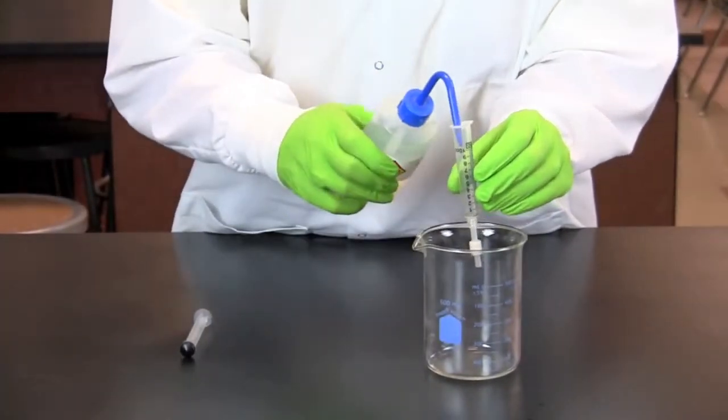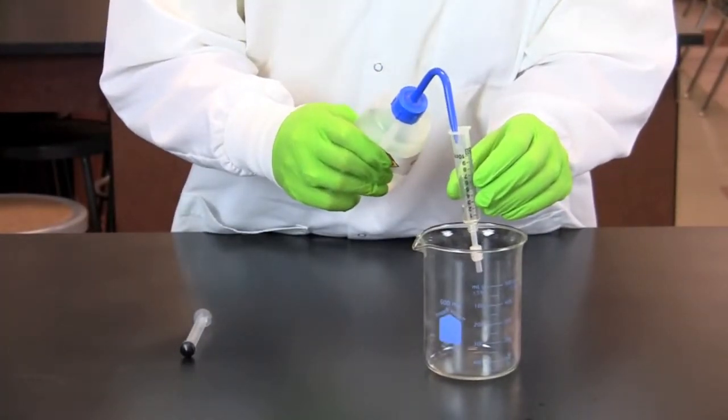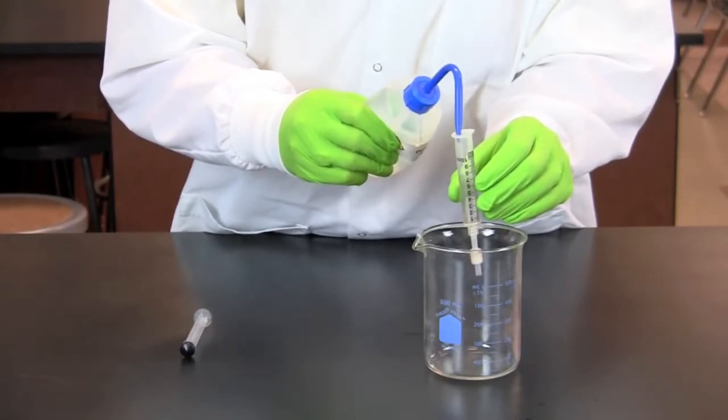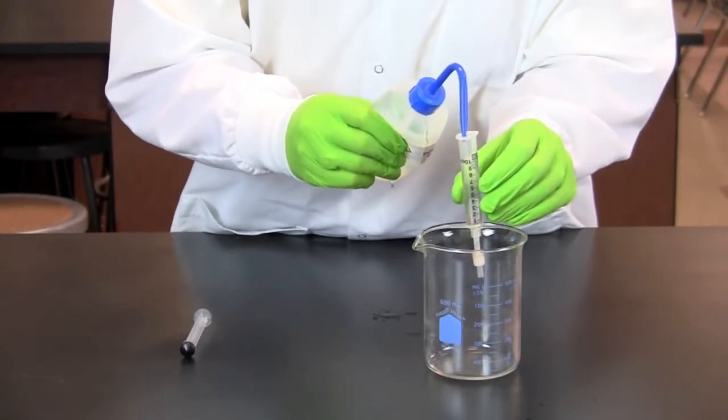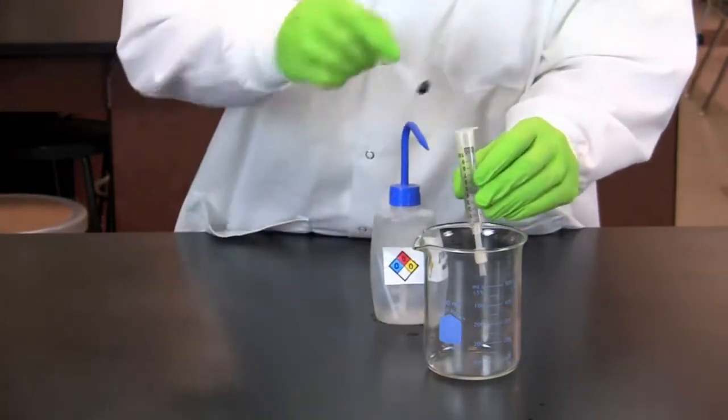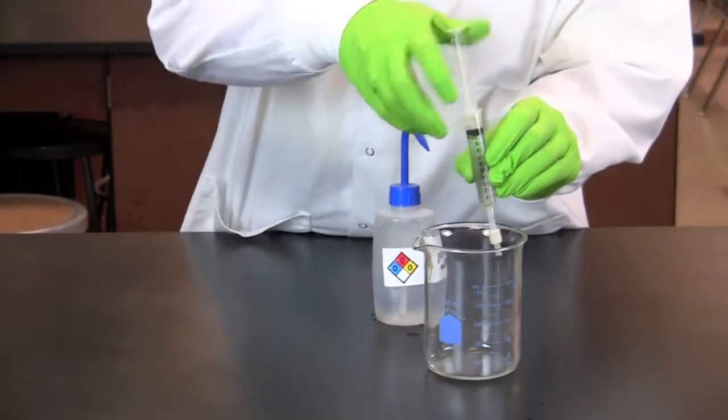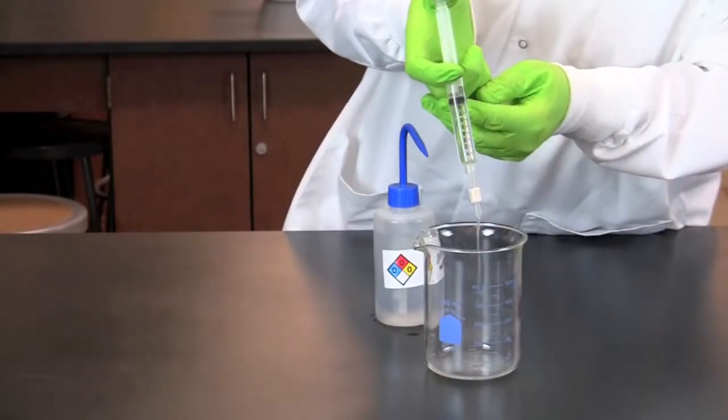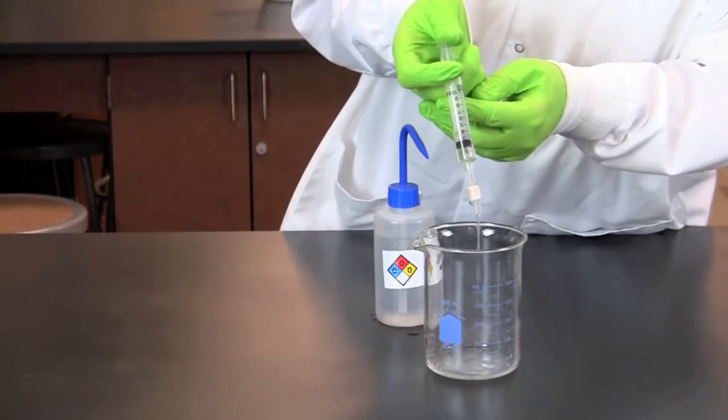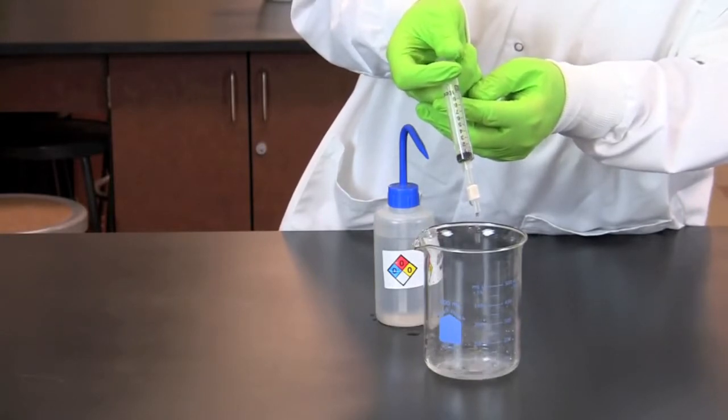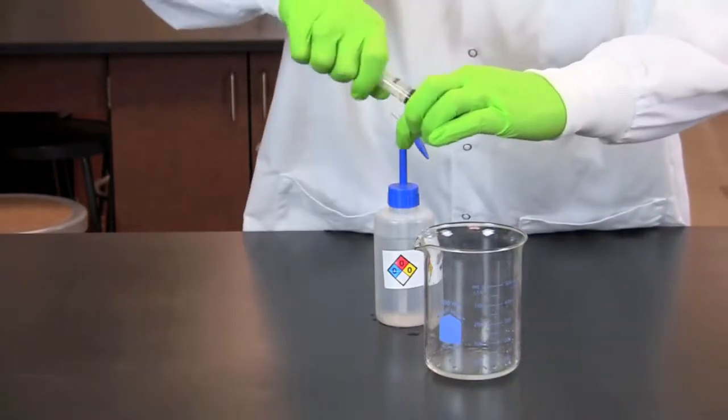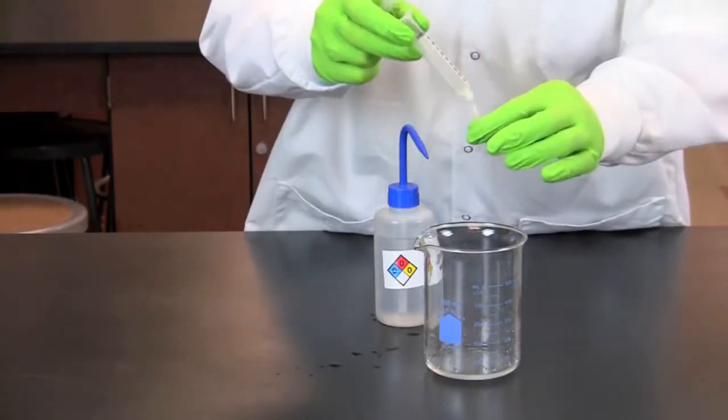Next, fill the syringe with 10 ml of distilled water. Once the water has completely flowed through, pull off the cartridge, pull out the plunger, and reattach the cartridge.